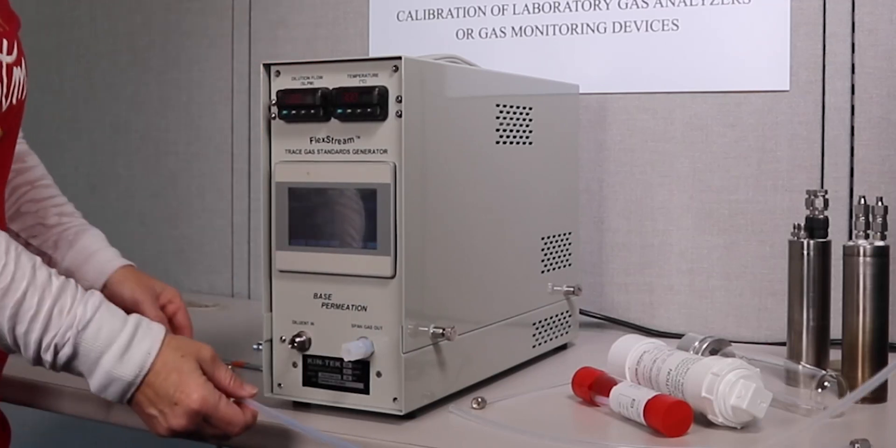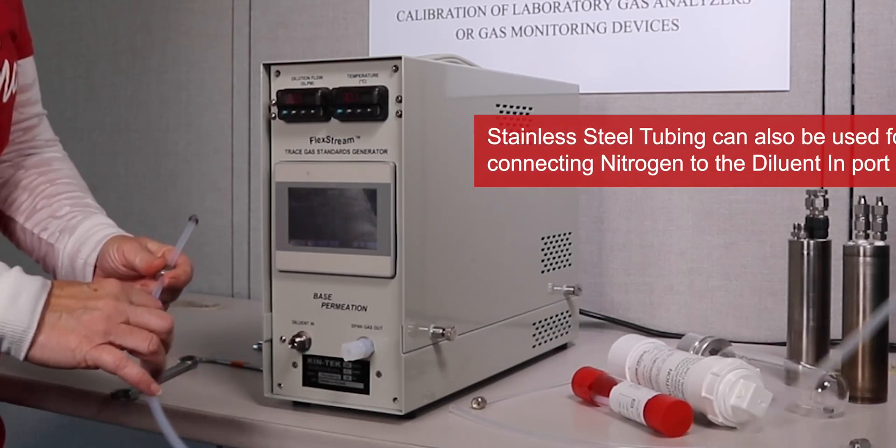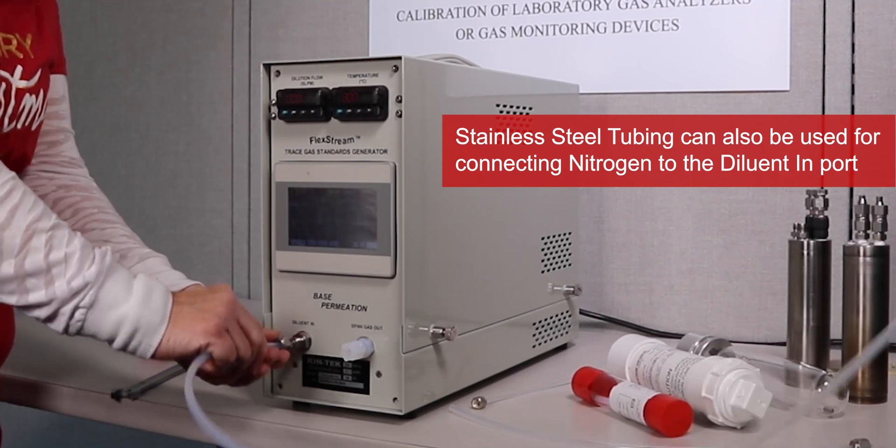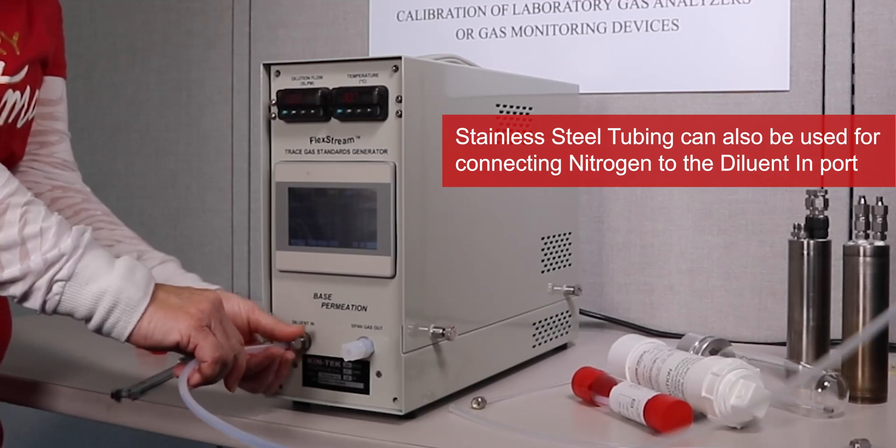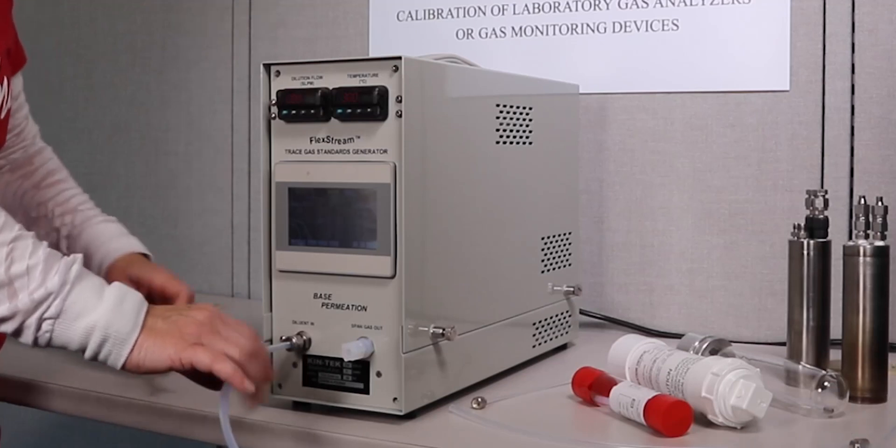Then we have a quarter inch Teflon tubing coming from our nitrogen cylinder. Our nitrogen cylinder again is set at a little bit above 60 psi. I'm going to connect that to my diluent in port using a 9/16 wrench to tighten it.